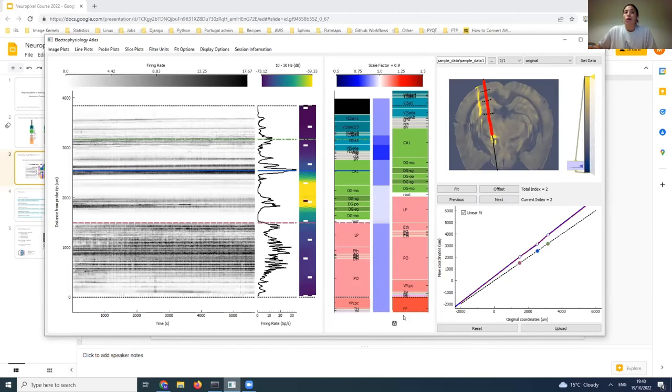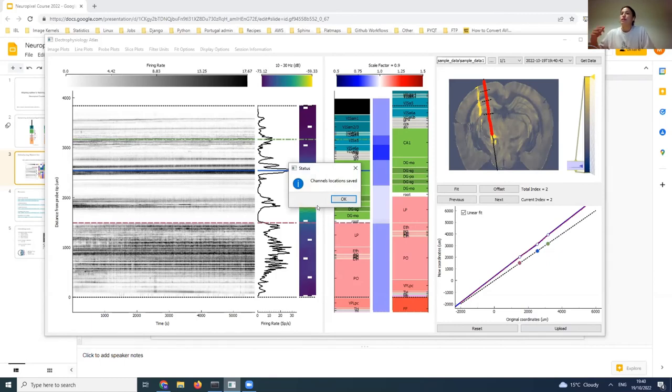Once you're happy with your alignment, you can then just hit this upload button, confirm, and it will save the new location of your electrode channels and their coordinate in 3D space, and also the brain region that they've been assigned onto a file on your local system. And you can then use those.